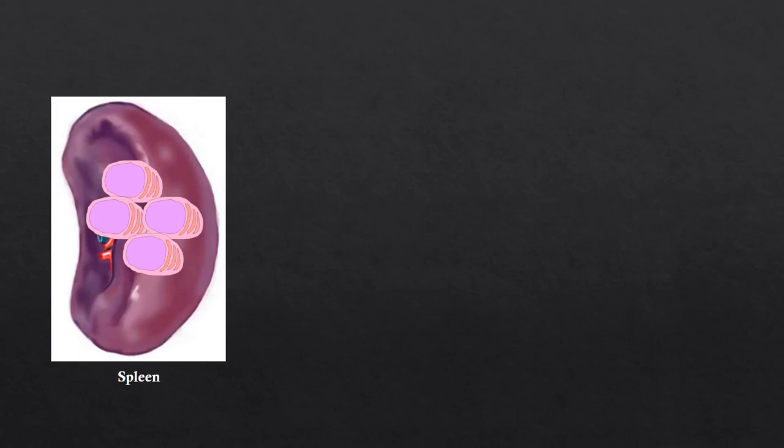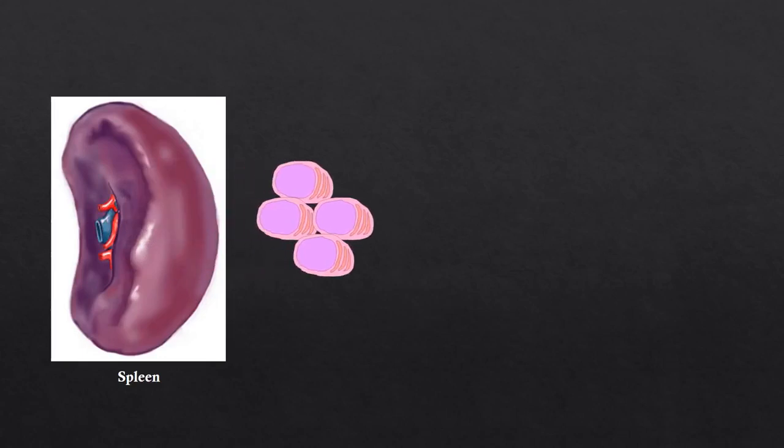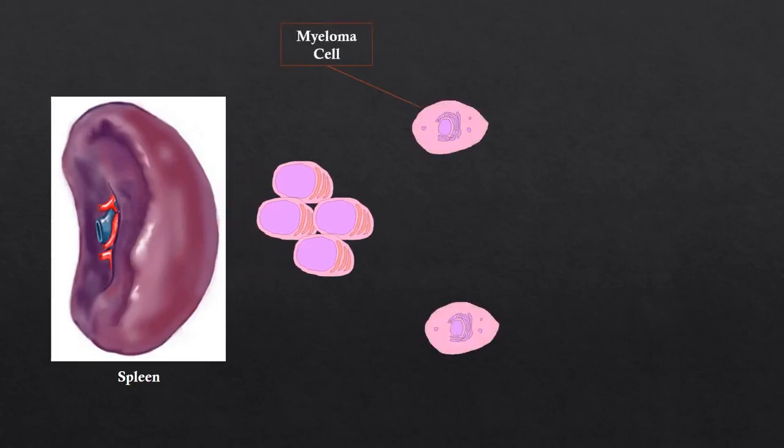To create such monoclonal antibodies, researchers most often use the hybridoma technique. After presenting the antigen to the organism, we remove the B cells from the spleen that were producing the antibody. These B cells are then fused with myeloma cells. A myeloma is a form of cancer and is a well-categorized immortal cell line. Specifically, myelomas with the HGPRT deficiency.